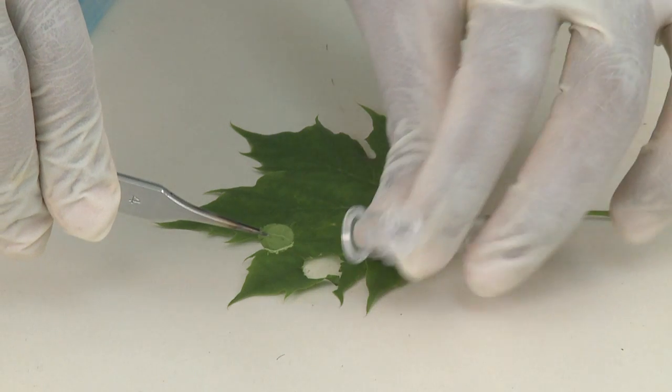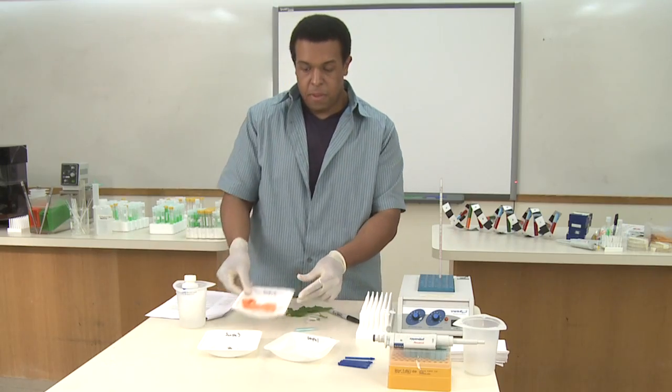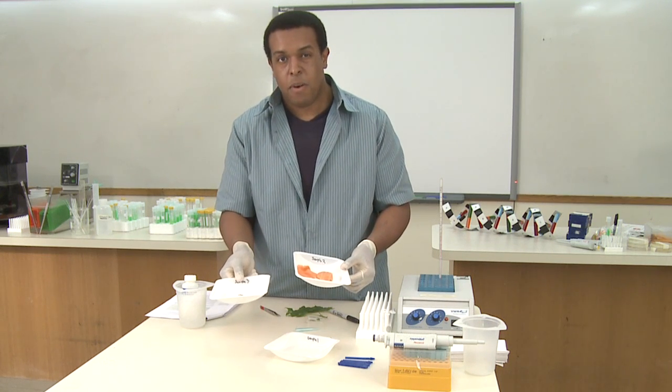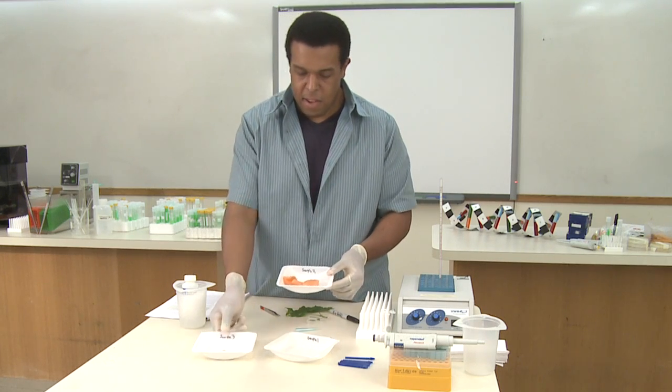I'll use the forceps to grab this out of the pipette tip. Now working with fish or other things such as insects, you're looking for about 10 to 20 milligrams, which is a very, very small amount of sample.